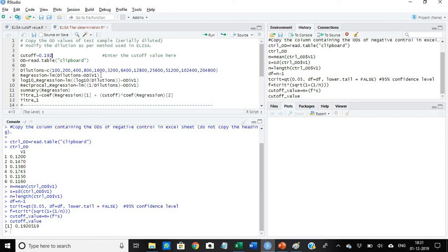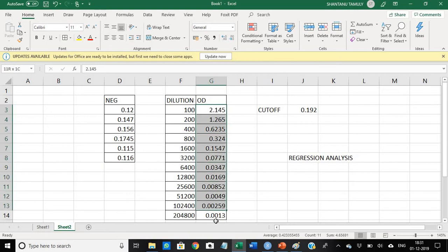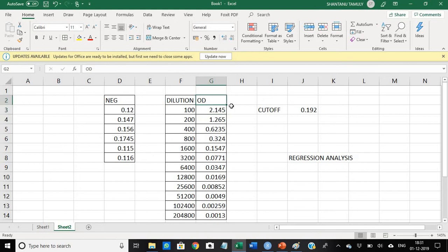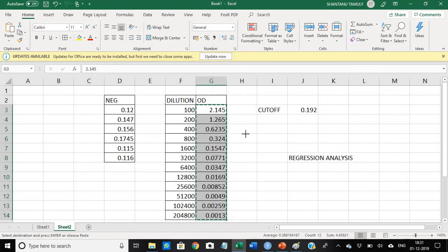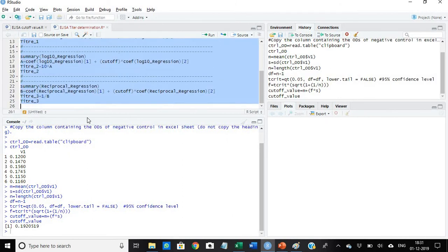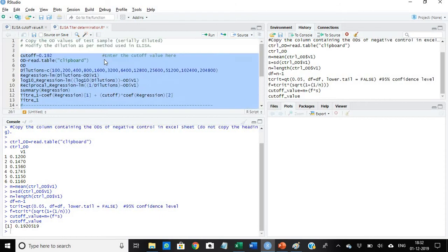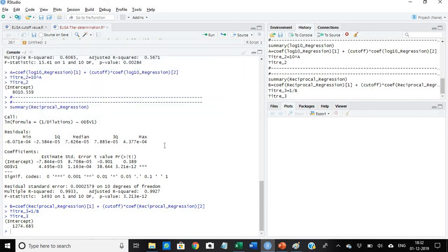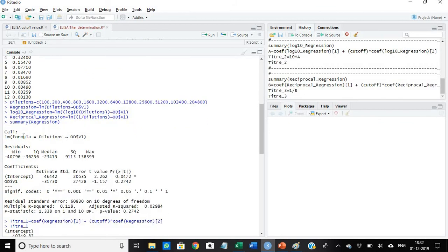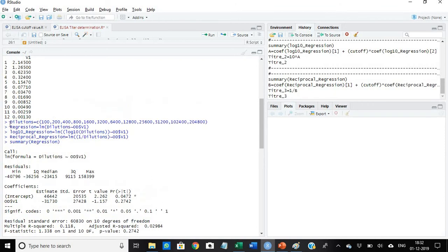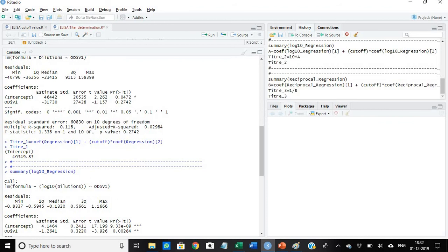Thereafter what is to be done, simply I will have to select the values. Remember you should not select the header, you should select only the values. Select the values and then copy it. After copying it, select all the commands here and then click run. Once we click run, this is the console part of the R, so we just drag it up. This is the summary of our regression.